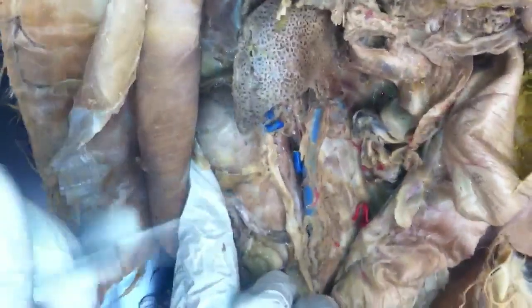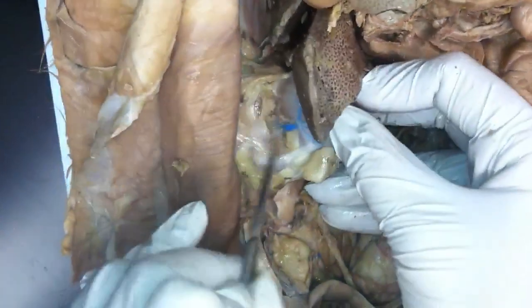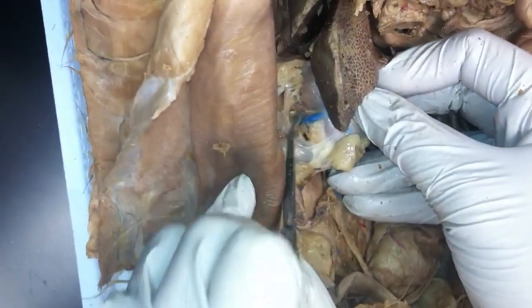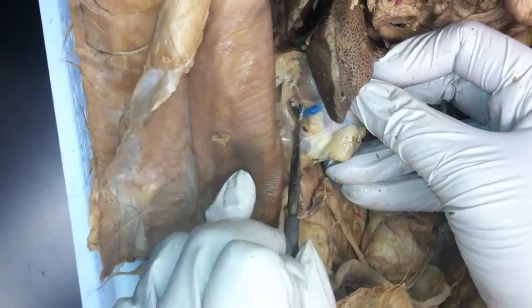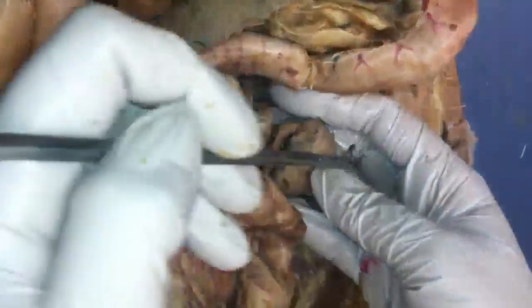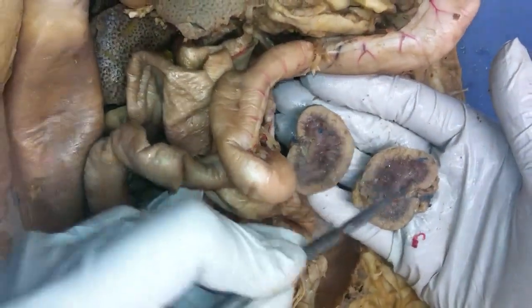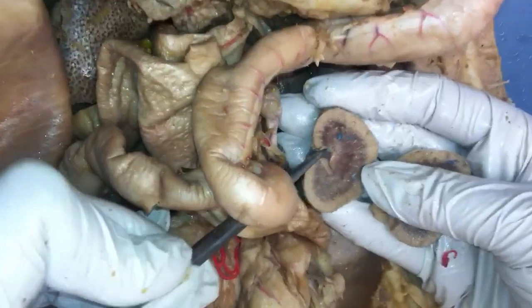The kidneys, there's a kidney and the renal vein. Can't really see the renal artery there, maybe the backside. Usually the arteries are easier to see when you turn the kidney over. And where's the other one? There it is. And so this one we cut in half, the cortex, the medulla, and the pelvis, which is this collecting area right there.